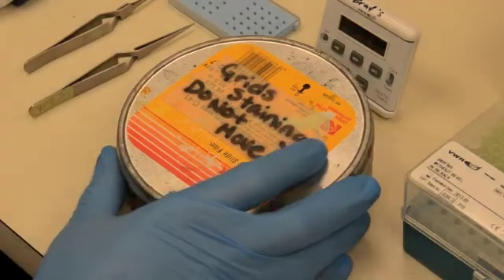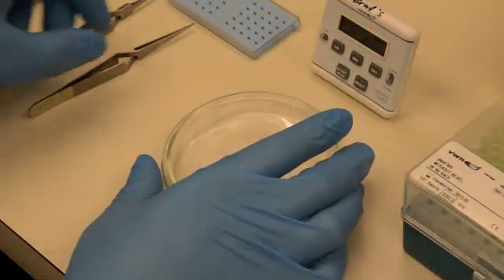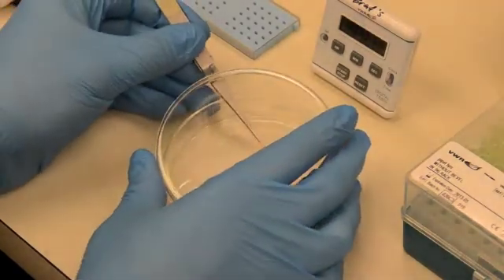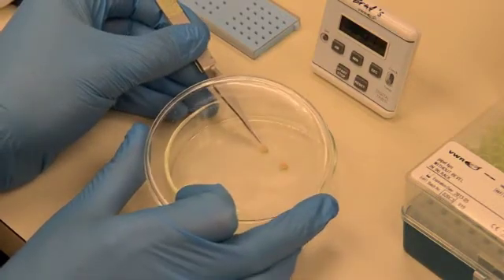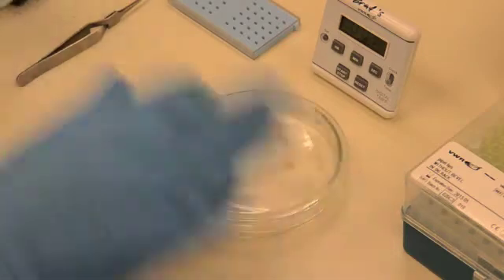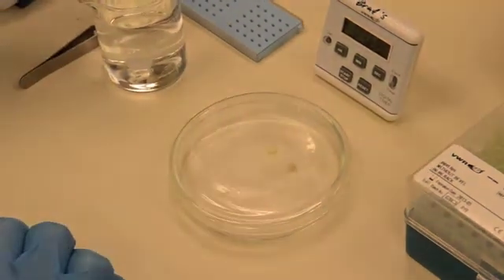Once the desired stain time approaches, remove the dark lid and get ready to rinse. Lift the petri dish lid and remove the first grid as close to the stain time as possible, and quickly place the grid into the first wash beaker. Wash the grid by moving it quickly up and down at least 25 times.